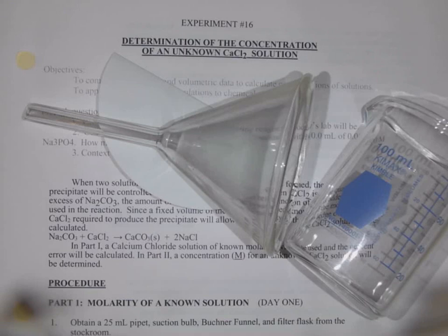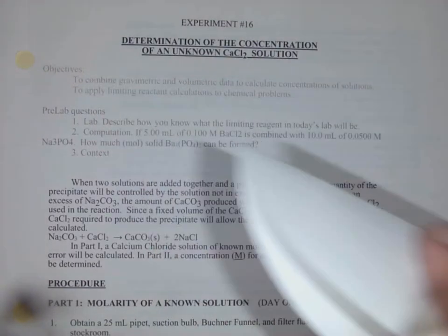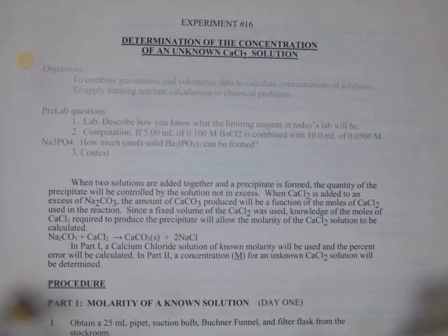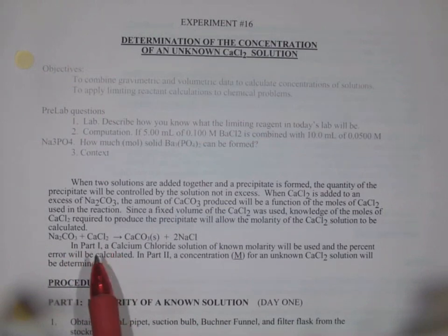Welcome to Experiment 16, the Determination of the Concentration of an Unknown Calcium Chloride Solution. To get started, what we're going to be doing in this lab is conducting a reaction where we take sodium carbonate and allow it to react with calcium chloride.